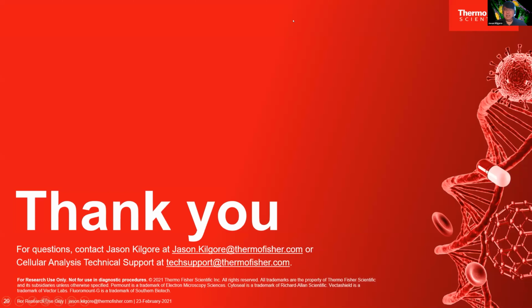Okay, any questions? Thanks, Jason. I have a question. You're talking about the prolonged live imaging, right? And the solution is to add. And it's not as common as it should be to use a special media for live imaging. And my understanding there was that the emphasis was in removing.